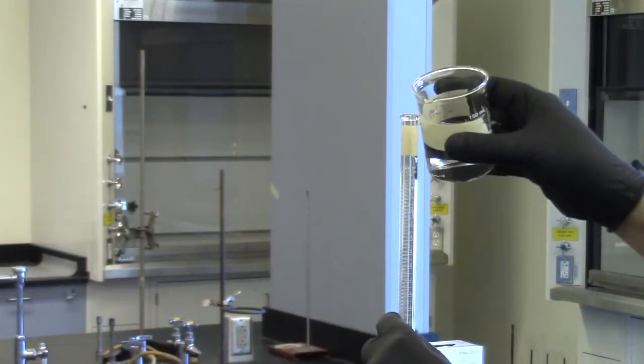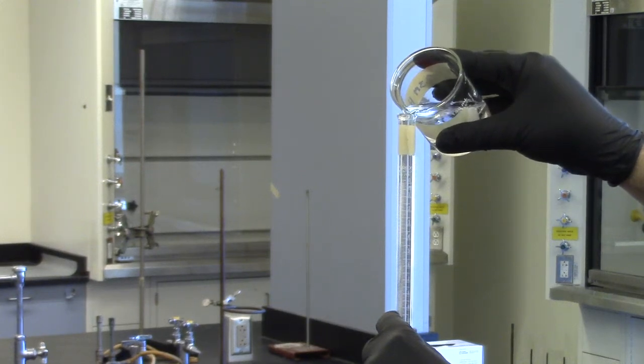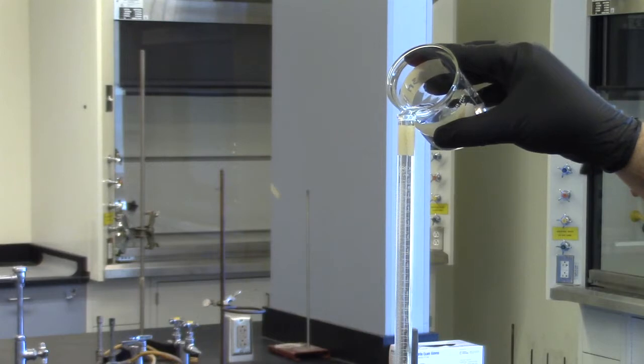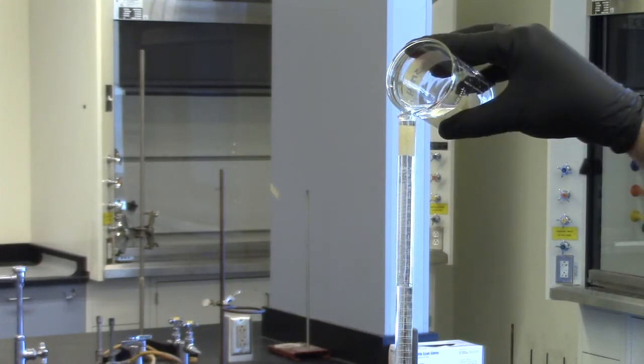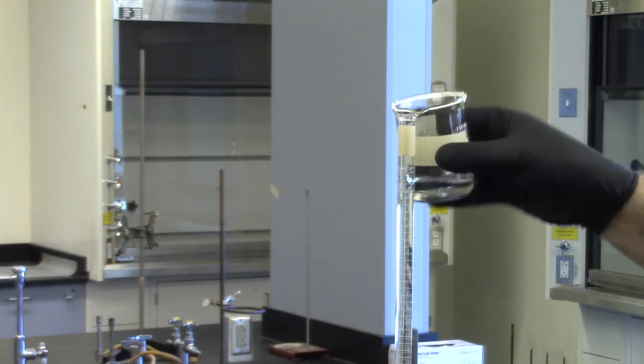Now that the burette is rinsed, add HCl solution to the burette. Fill it close to the top line, which is zero. If you go past zero, drain some down into the waste beaker. Be sure to record your initial volume.